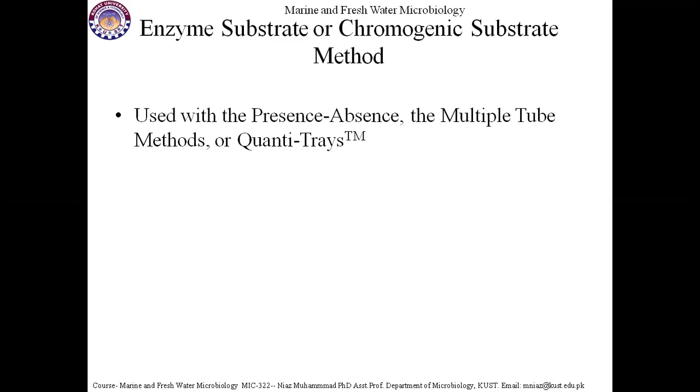If color is not changed, there are no microorganisms, no coliform present.